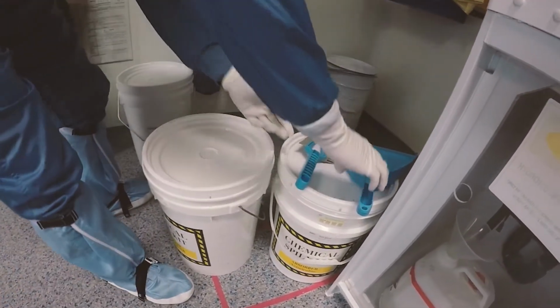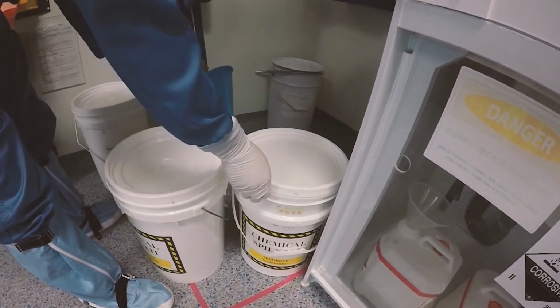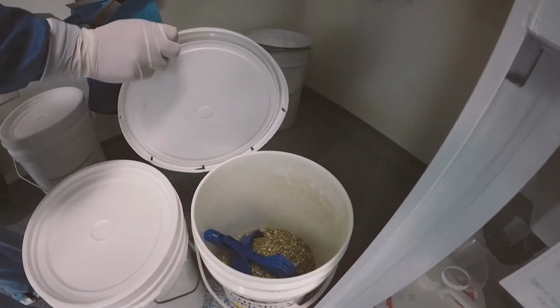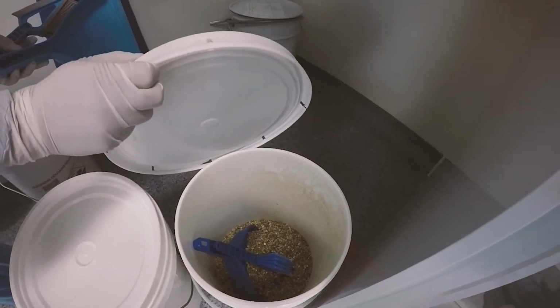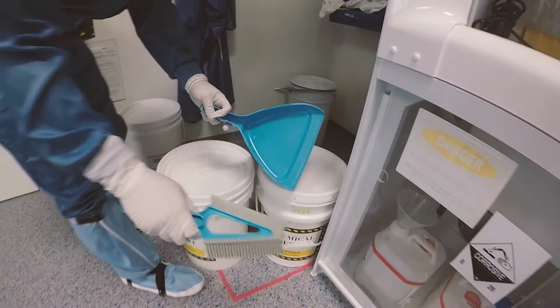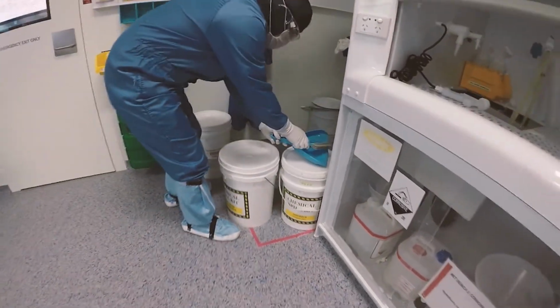Alert a process engineer. Hazards should be reported within 24 hours of the event occurring. Events can be recorded online at monash.edu/OHS or by filling out a hazard reporting form available at the document station outside of the gowning room.